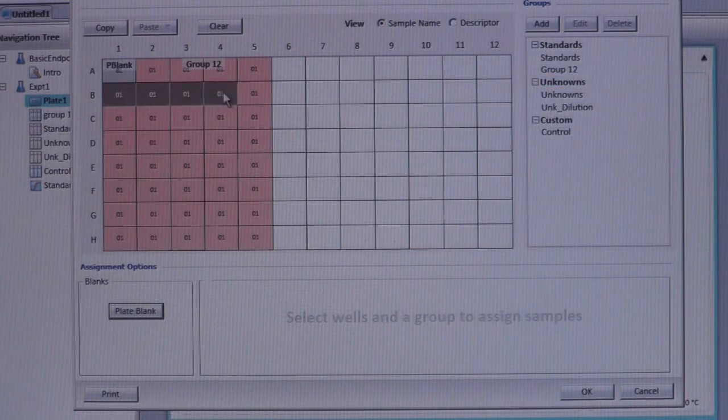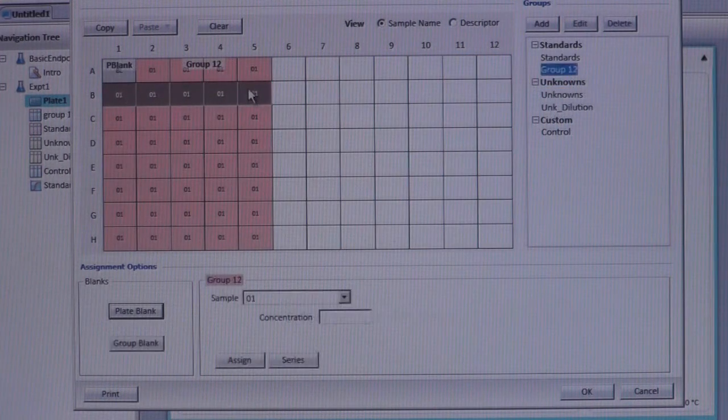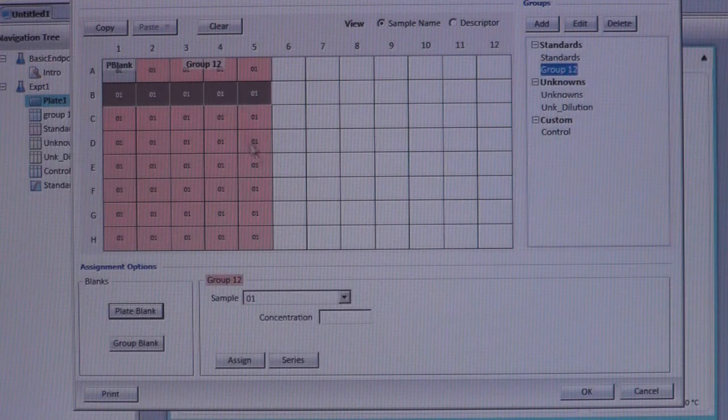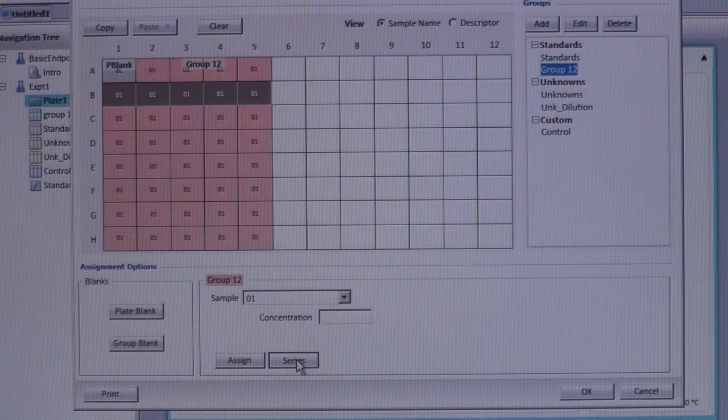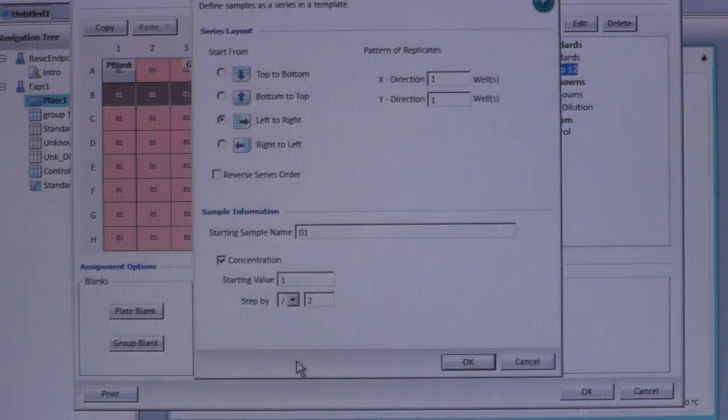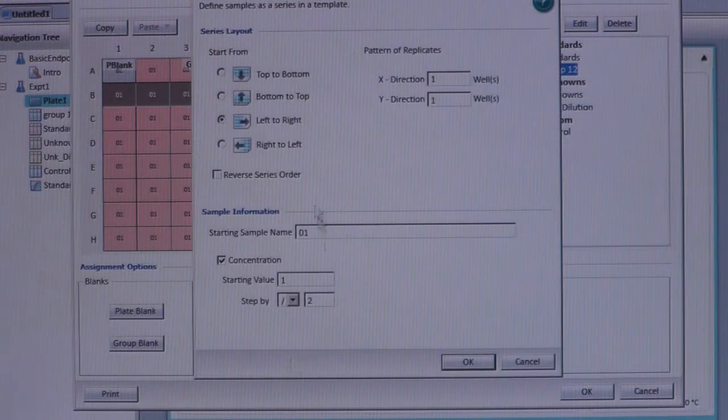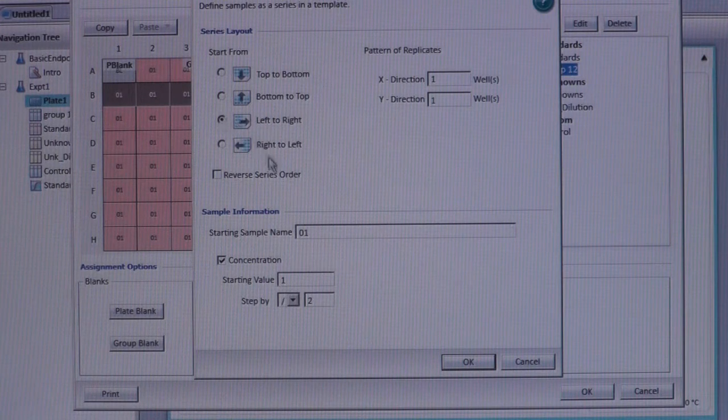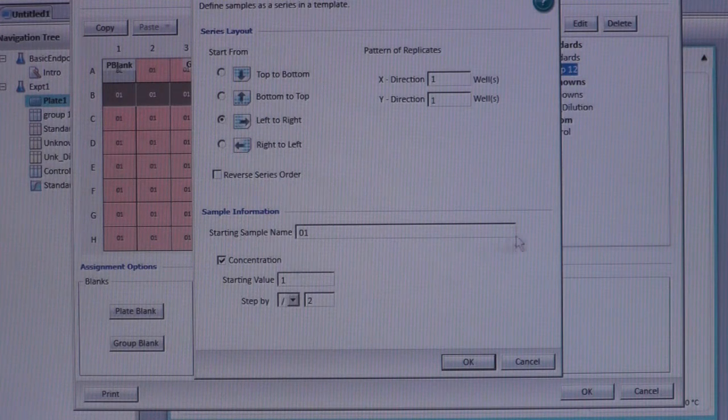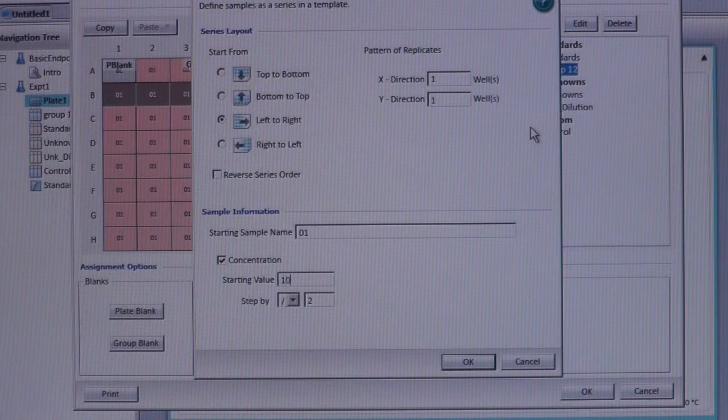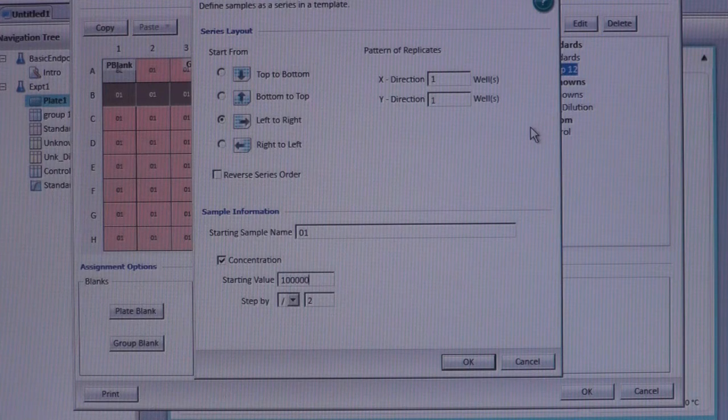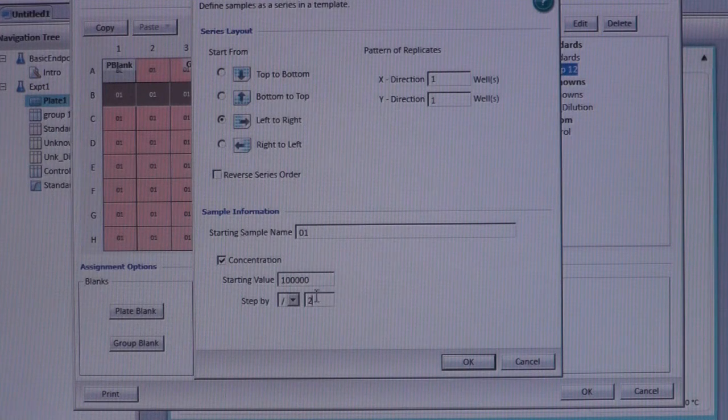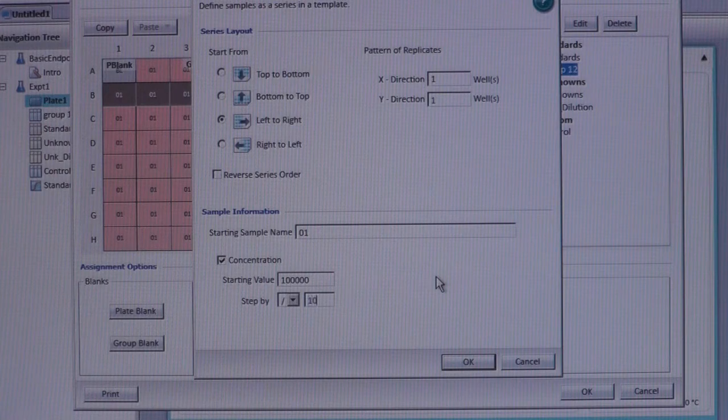The Series option allows the user to input specific concentration values if a standard curve is used. In this example, the standard curve runs from left to right, so that option is selected. The starting value of our standard curve is 100,000, and it reduces by 10-folds every step.